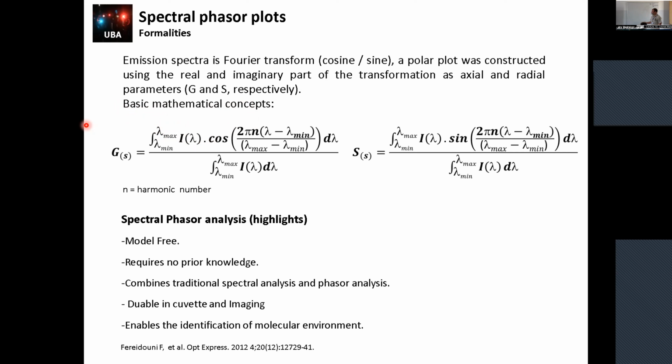And then, as Enrico mentioned, in our Phasor transformation, we always normalize to the total intensity that we collect. And this is very important, because it is what warrants in our transformation that all the linear combinations and additions, etc., work. Otherwise, you cannot claim these properties. And this property will be very, very important for the analysis that we would like to have.